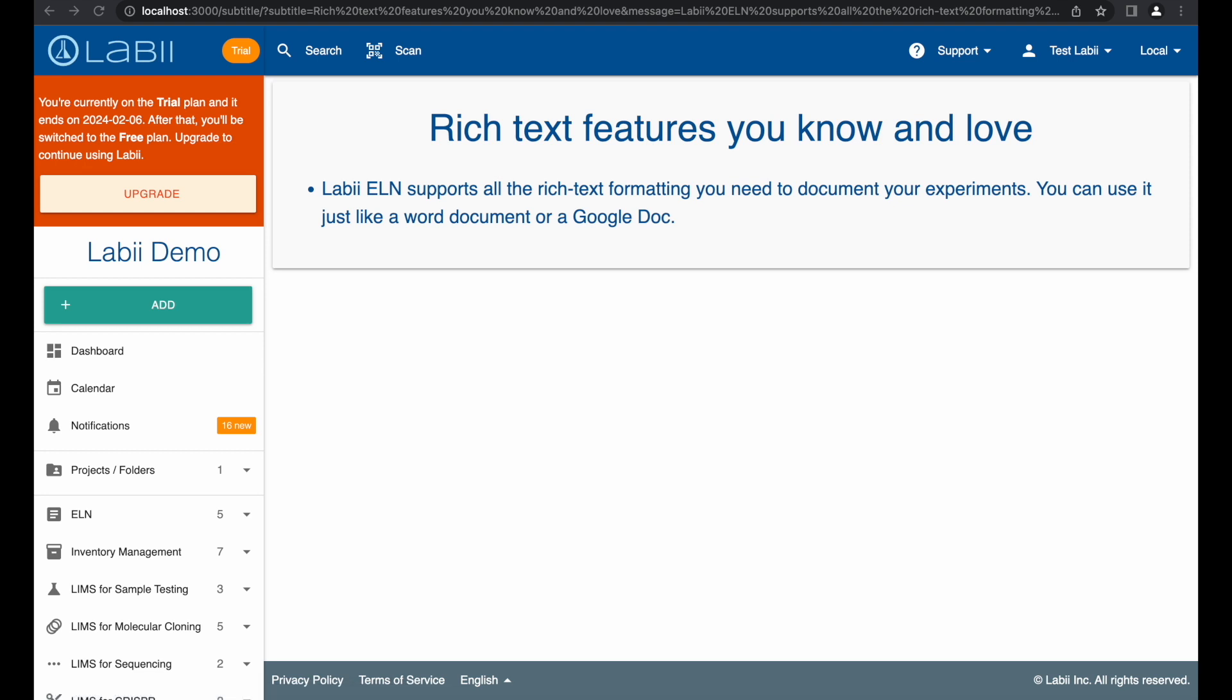Labii ELN supports all the rich text formatting you need to document your experiments. You can use it just like a Word document or a Google Doc.